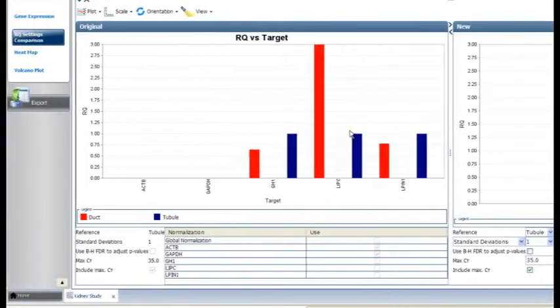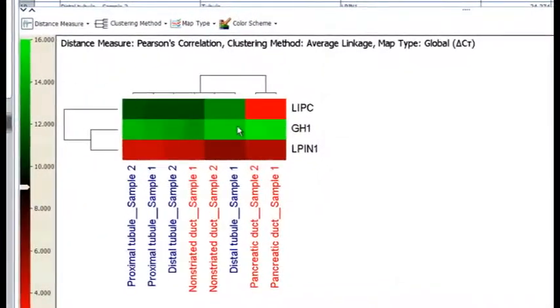Heat map is the next option under the workflow menu. For anyone who's run microarrays before, heat map should look pretty familiar. These are graphs that use color coding to map out similarities in expression across our samples and genes, and that cluster these hierarchically, often allowing us to recognize important relationships among particular samples or genes. We don't have time to cover heat maps extensively, so I'll just mention a few capabilities here.